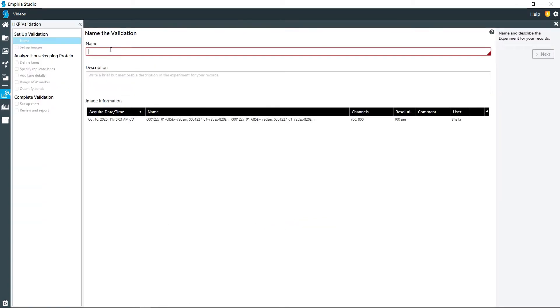So this is actin and COX-4 are my two antibodies that I'm testing right here.